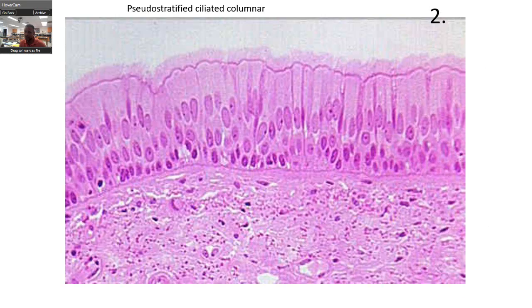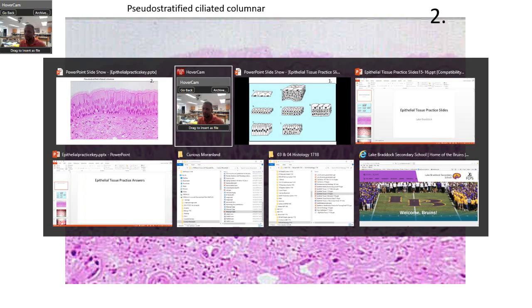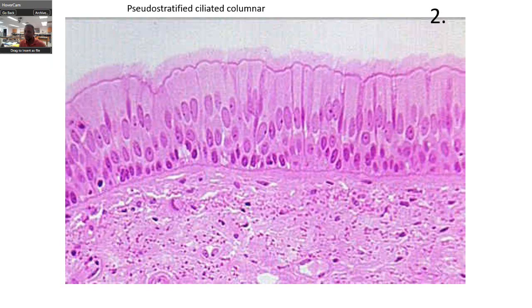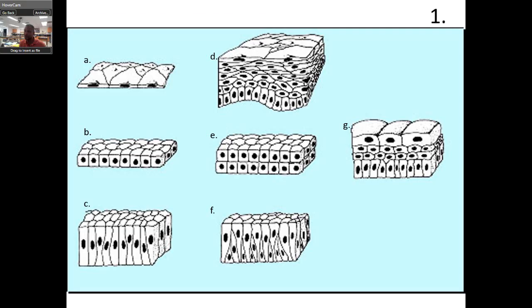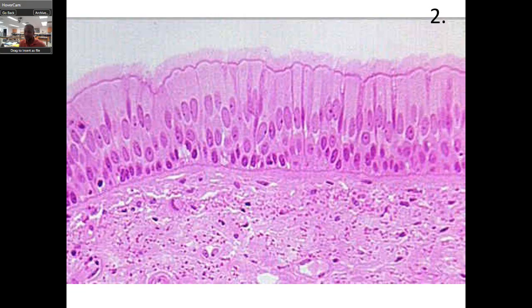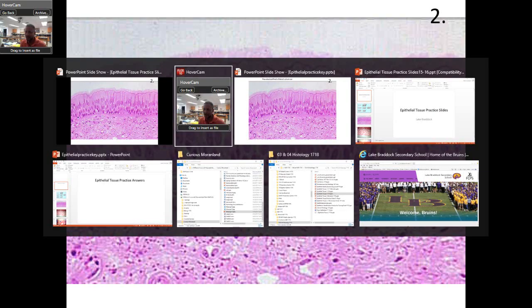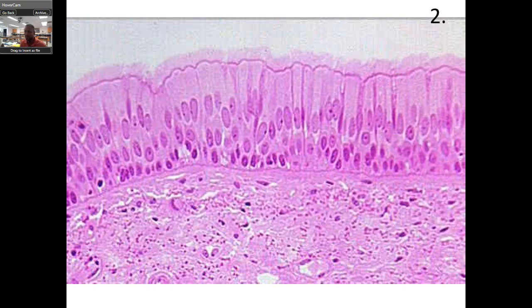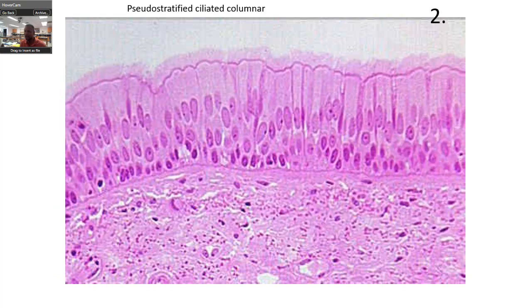Here's number two — pseudostratified columnar. Let me go in order and start again. So that's pseudostratified columnar.